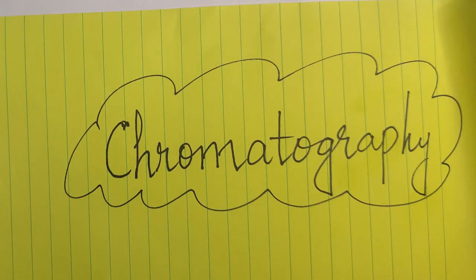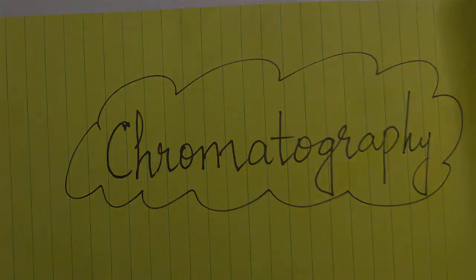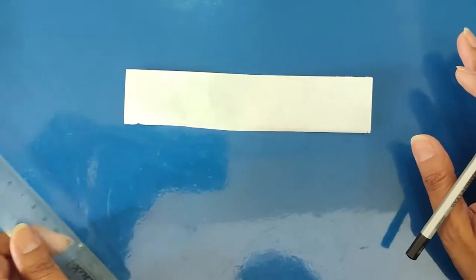So today in this lesson, you are going to learn about the technique that is called chromatography. You will learn how we perform this chromatography technique during the experiment. Today I am going to teach you what chromatography basically is and how we are going to perform this experiment.